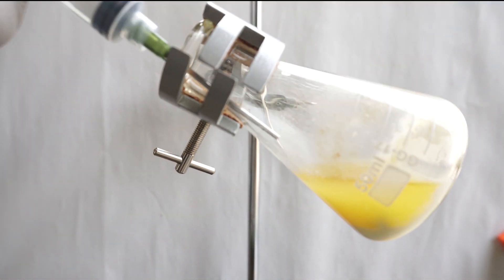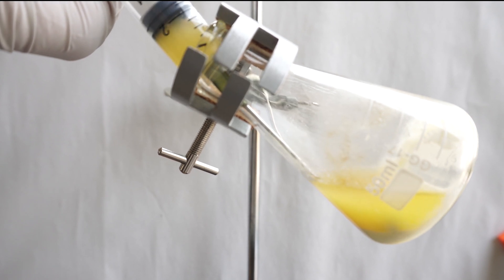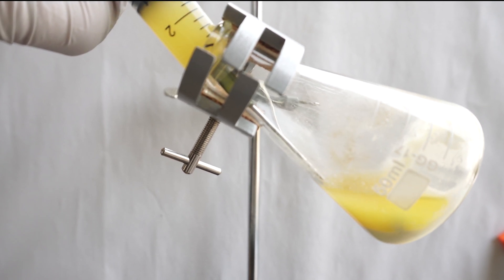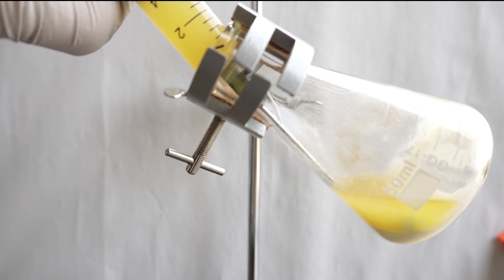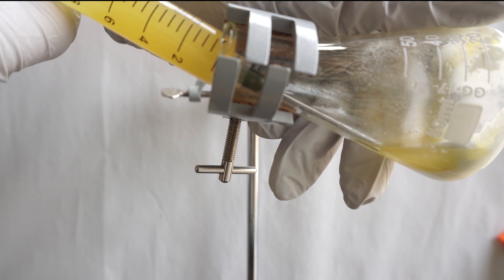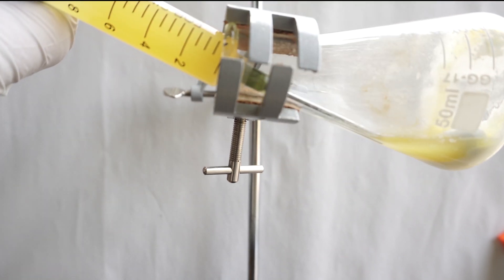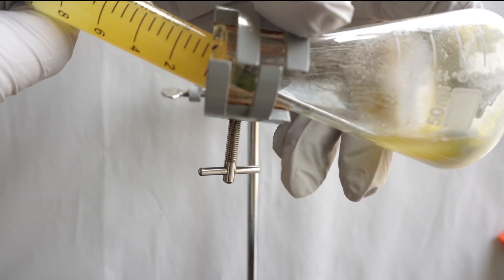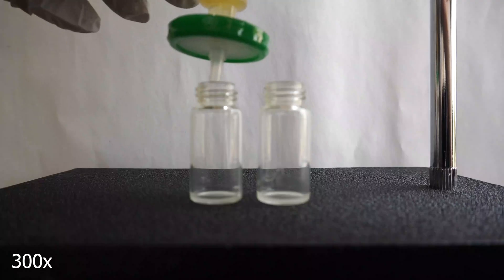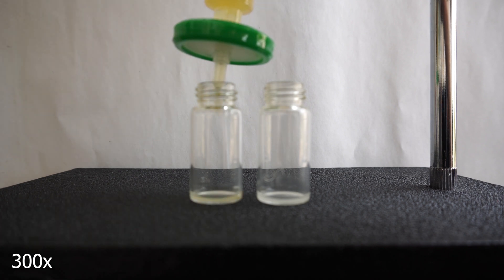Once all of the particles have sunk to the bottom, we are able to pull the top cadaverine and ethanol layer into a syringe, followed by running it through a syringe filter to further remove any of the powder that got brought with it. Take care not to press too hard on the syringe filter as they can be ruptured.